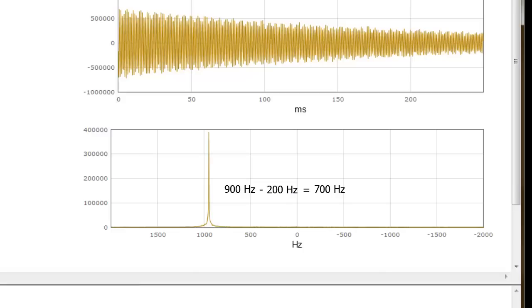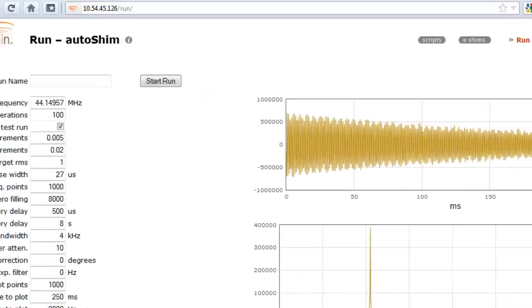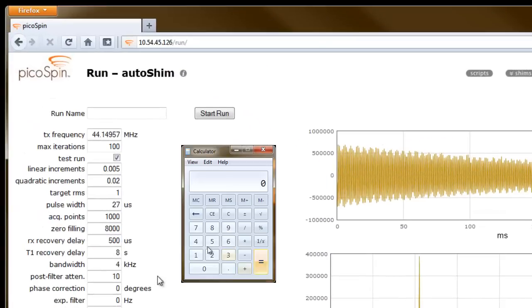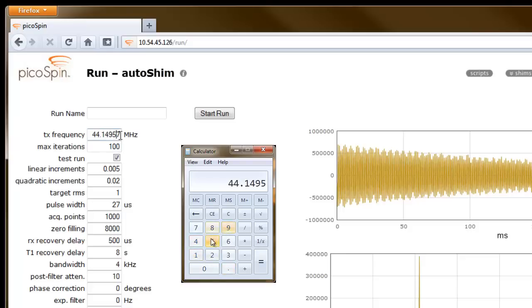So I'll need to change the fourth decimal place. Therefore, I'll change my current transmit frequency of 44.14957 MHz to 44.15027 MHz.